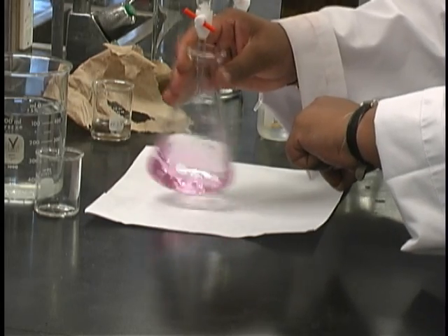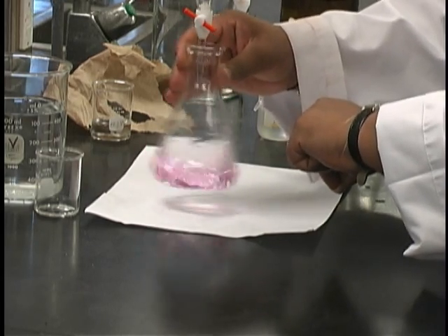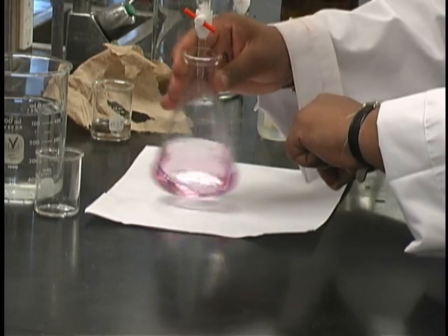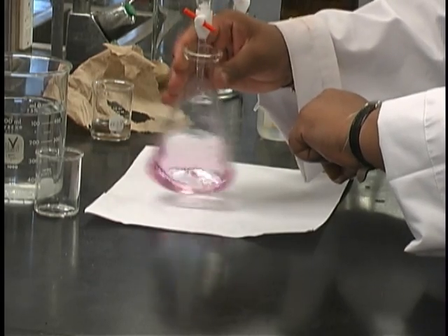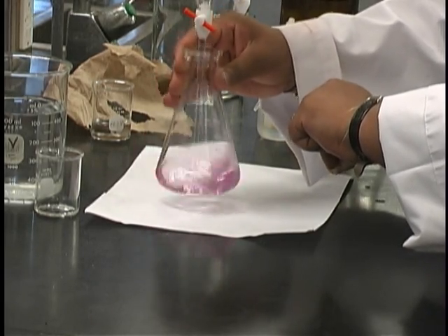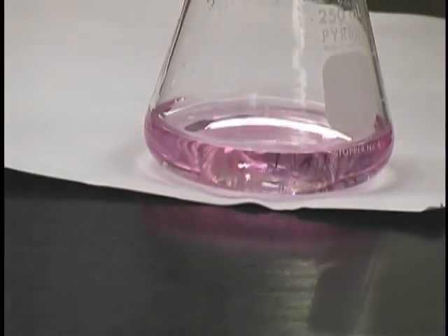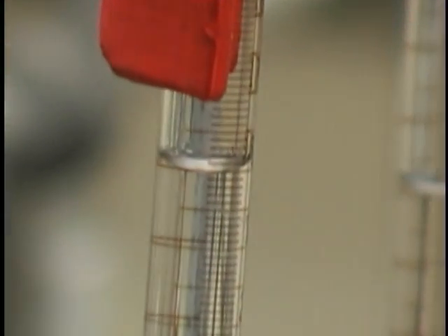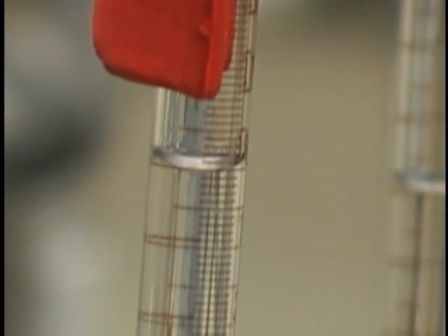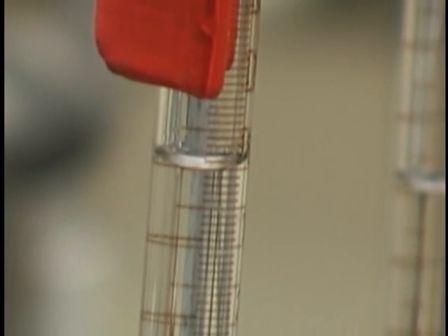If the pink color disappears before 30 seconds is over, then you still need to add a small amount of the base. If, however, the pink color remains, you have successfully completed the titration. You are looking for the palest pink color you can obtain. Make sure to read the volume of the base before doing anything else — here, the volume is 18.05.